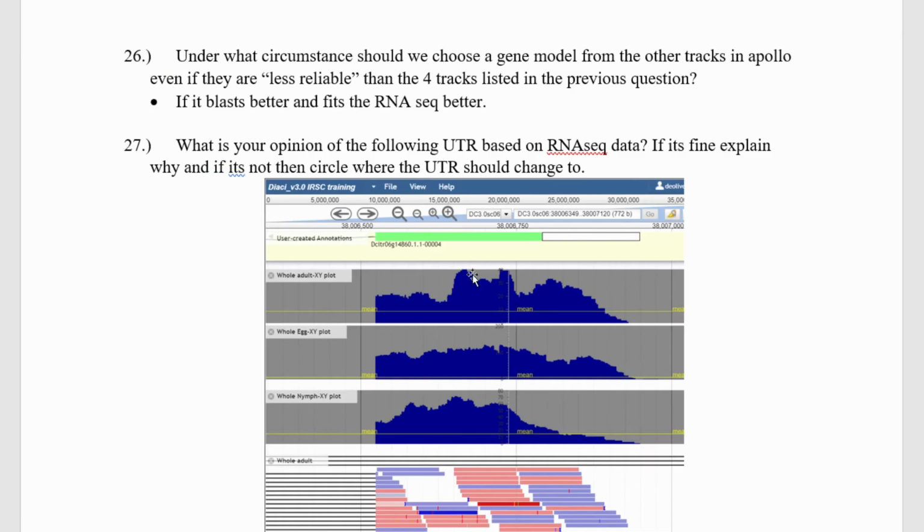So it's important to look at all these different models, as many as you can, the better, and then find the oddballs and see, do any of them look valid? Then test by trying to incorporate some of the more fringe ones and see if they have any valid part to them. Maybe you can include them and make your gene model better.